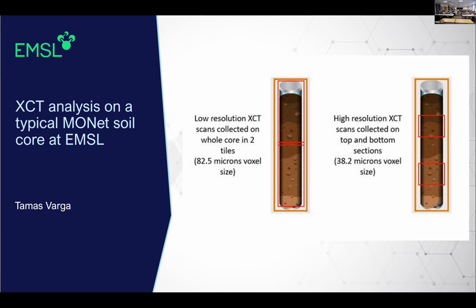Well, yeah, two questions there. One is, in the CT where you have a square-shaped detector plate, by scanning a 3-inch width, so basically zooming in so that only the 3-inch soil volume is shown in the image, we maximize the soil volume that is being looked at and maximize the resolution. So we have a 3-inch by 3-inch cube that we analyzed, and if you would go above it, or below it, it would be a little bit different.